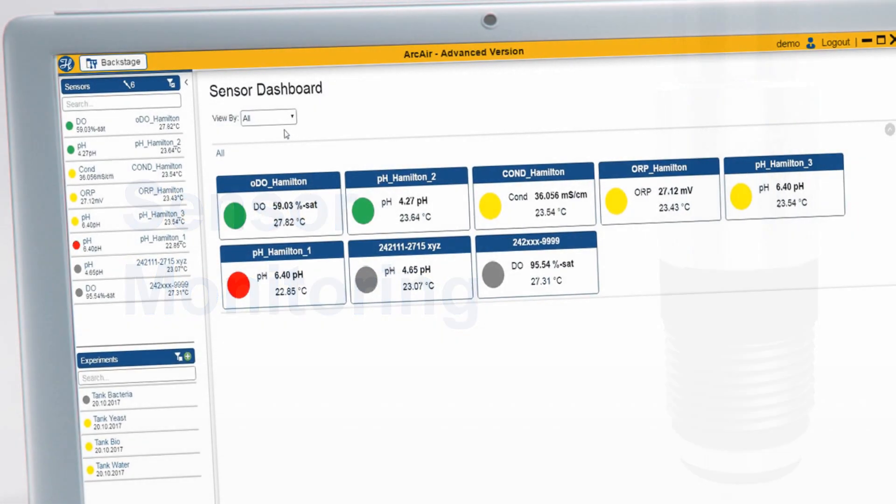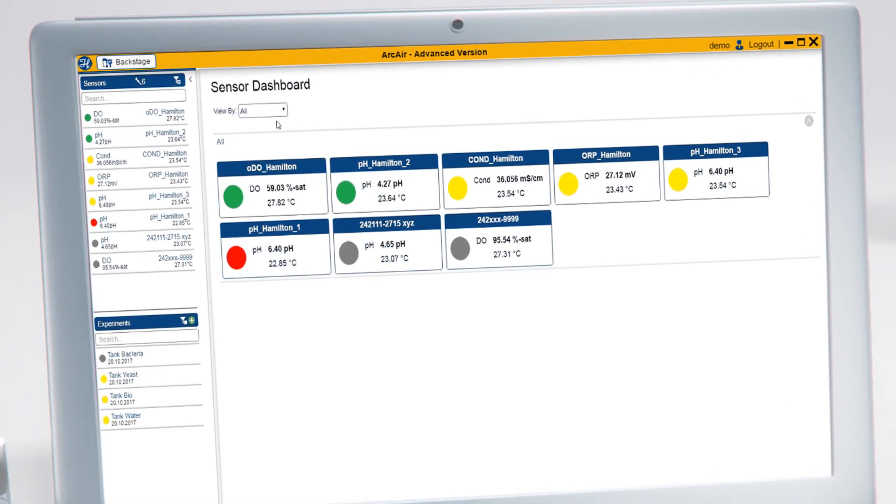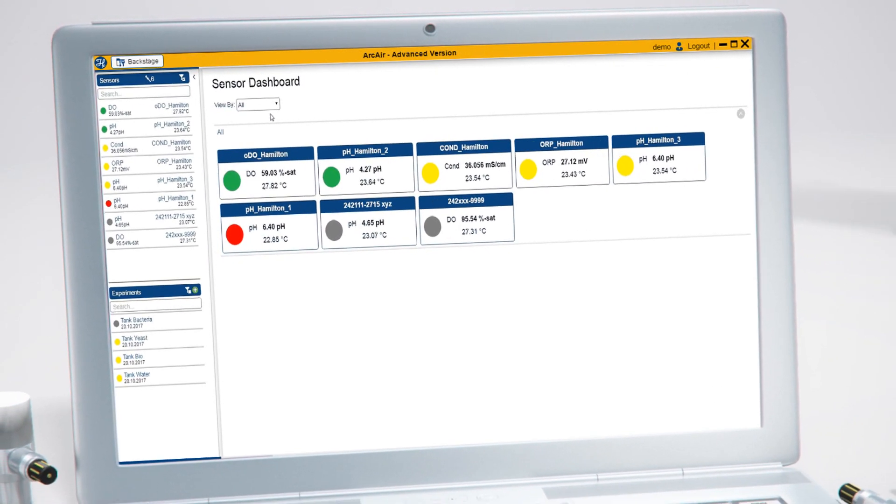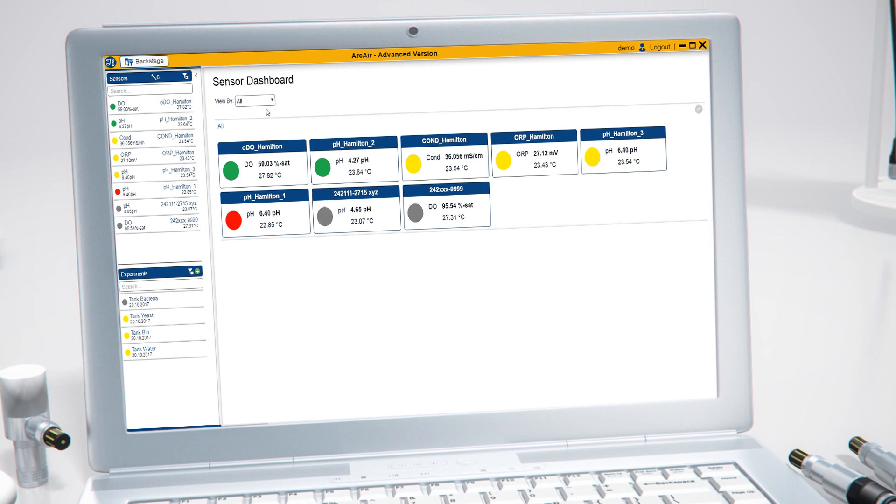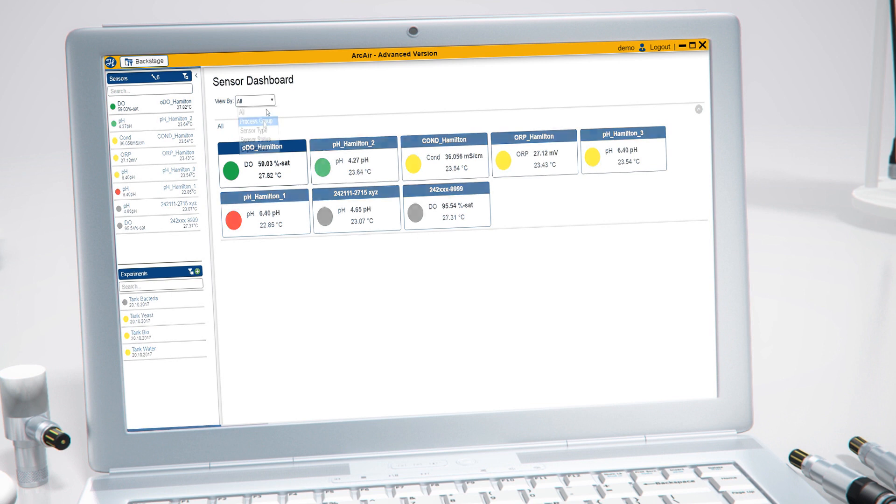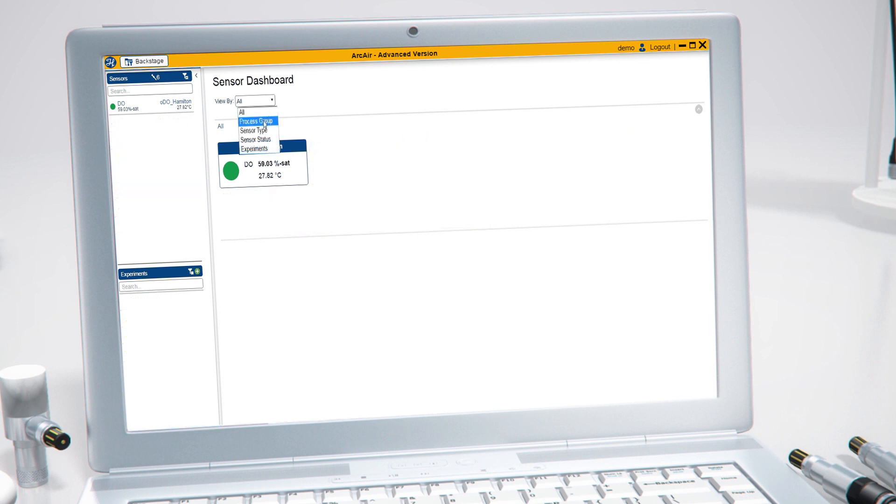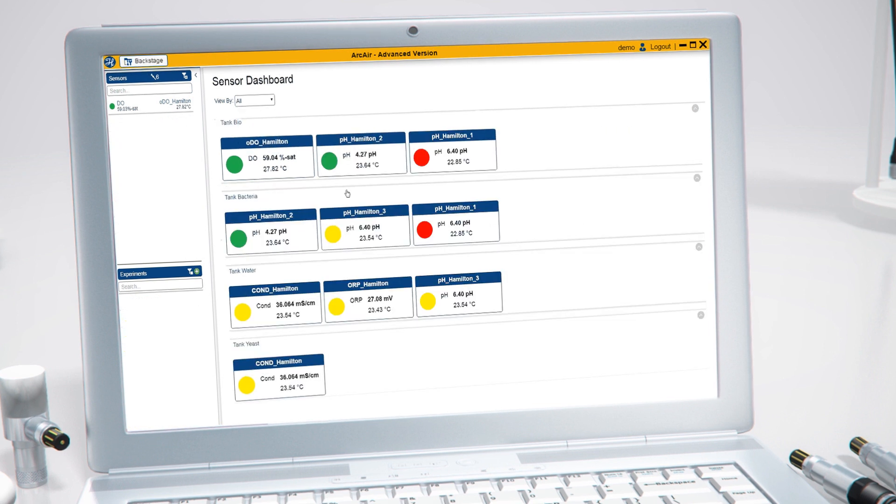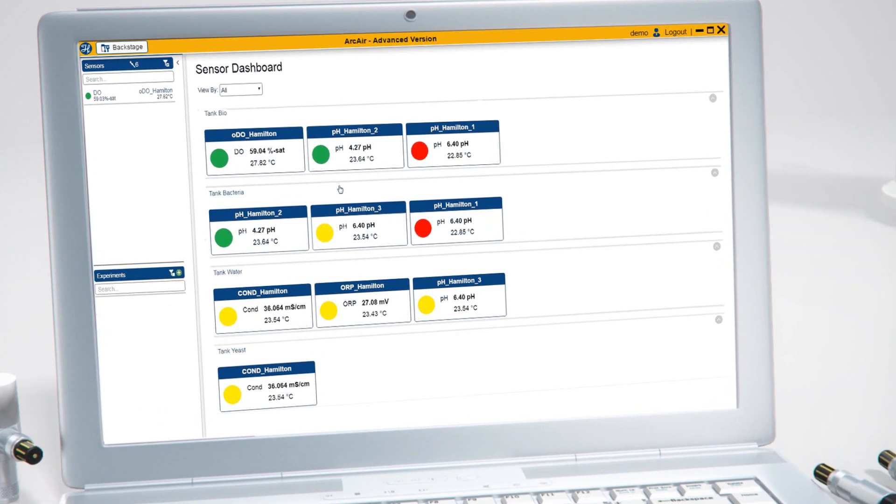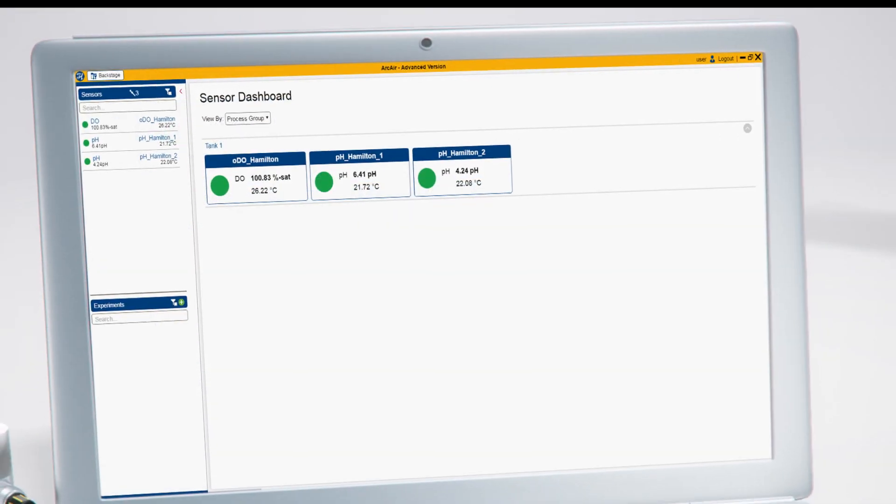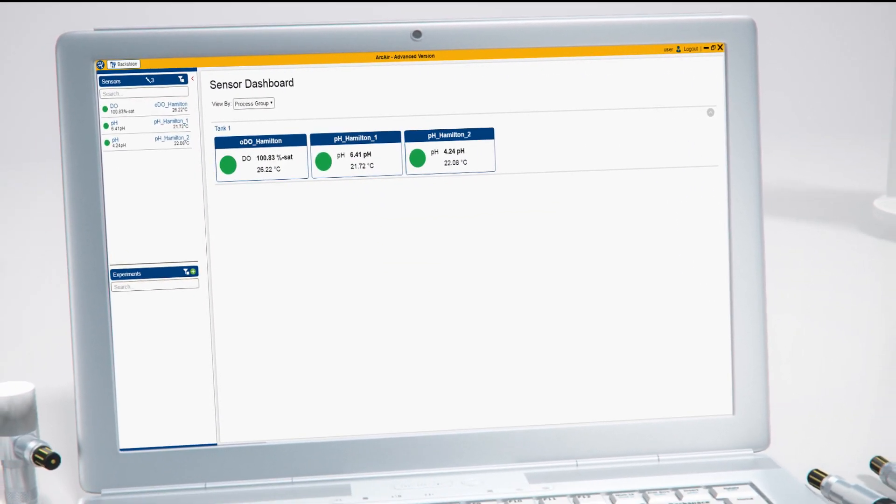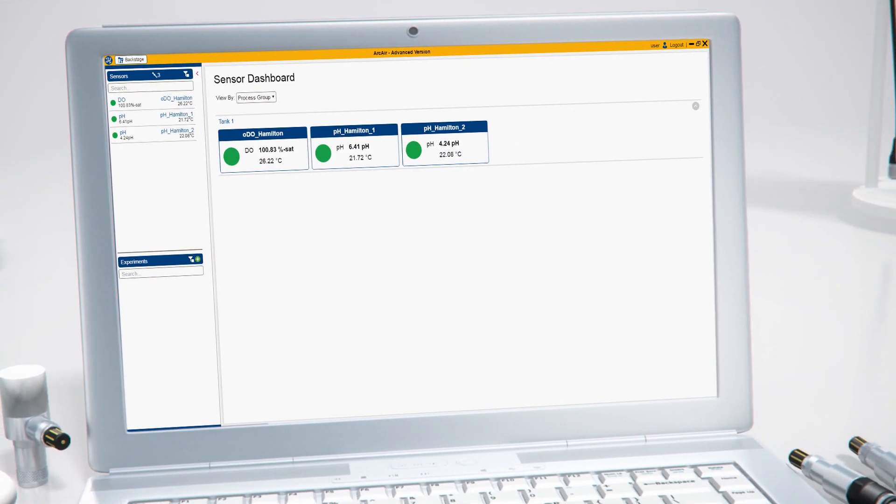The dashboard allows you to monitor the status of all sensors in the lab on a single screen. Colored indicators enable quick identification of sensors needing attention. You can use filters to display sensors according to your requirements. You can easily check all sensor information by selecting a sensor.